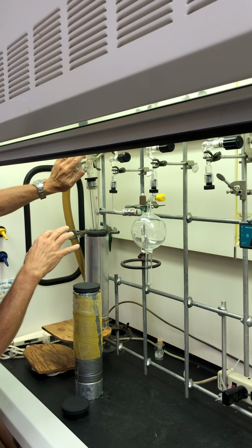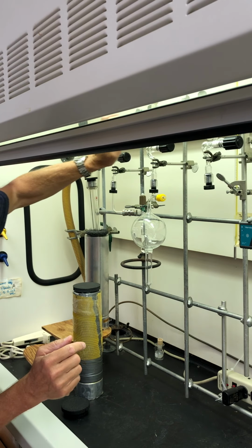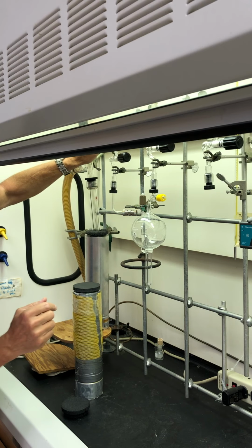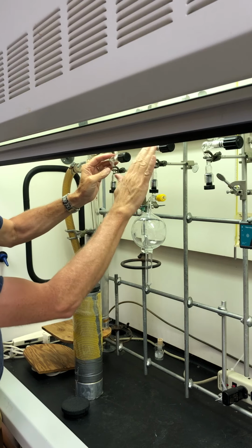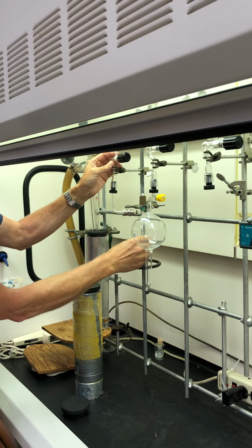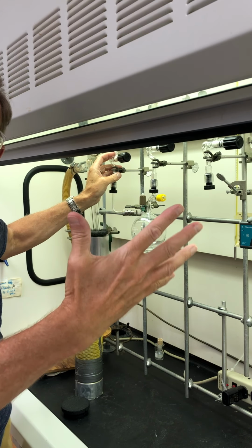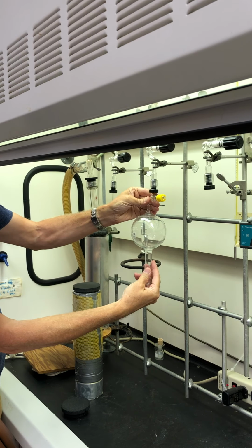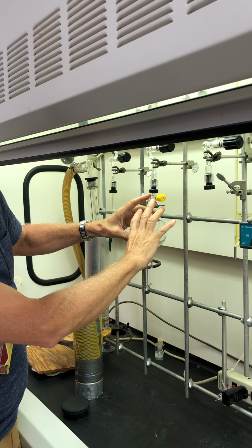And this valve here is the main valve that is referred to in your lab guide. It's connected through a large tube, that's the main body component of the manifold. And then there are three valves here, A, B, and C. A connects you to a sample tube with a liquid. That's the liquid that we're going to let become a vapor and fill, through valve B, this bulb, which we can remove from the vacuum line, with a known volume.